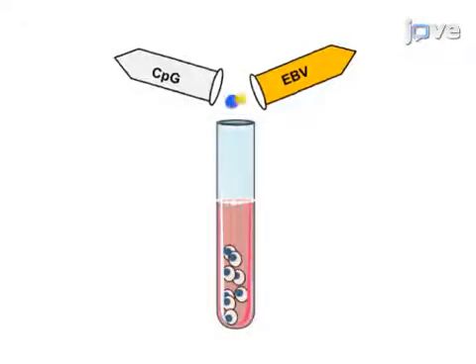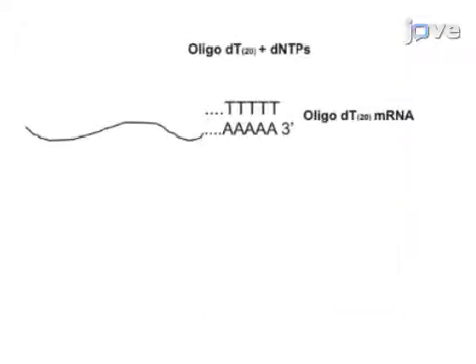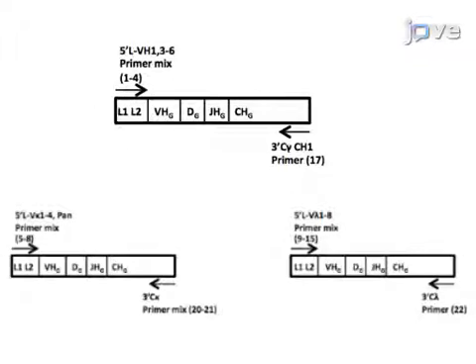Next, the cells are immortalized by infection with Epstein-Barr virus together with Toll-like receptor 9 activation by CpG-ODN 2006 and kept in culture. The final steps are to isolate RNA from clones that tested positive for IgG production by ELISA and to generate copy DNA from both light and heavy IgG chains. Ultimately, the IgG sequences can be cloned in mammalian expression vectors to produce high quantities of monoclonal human IgG.